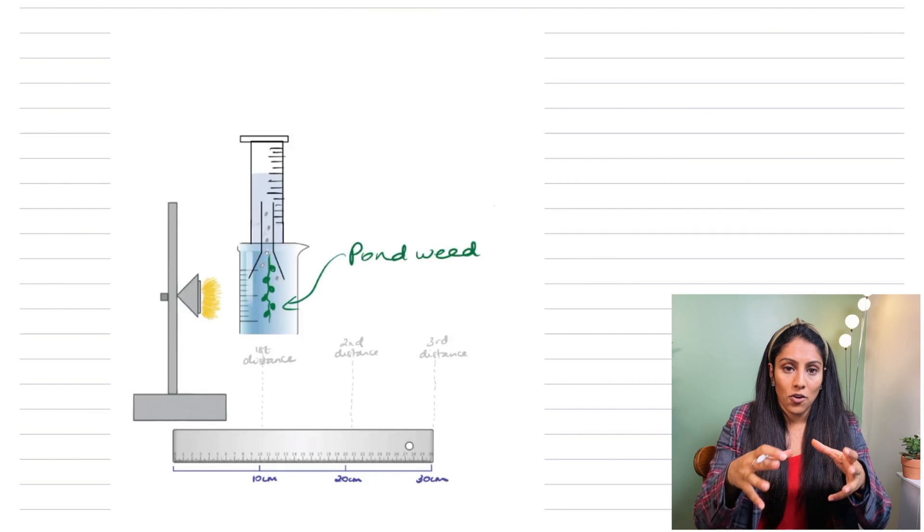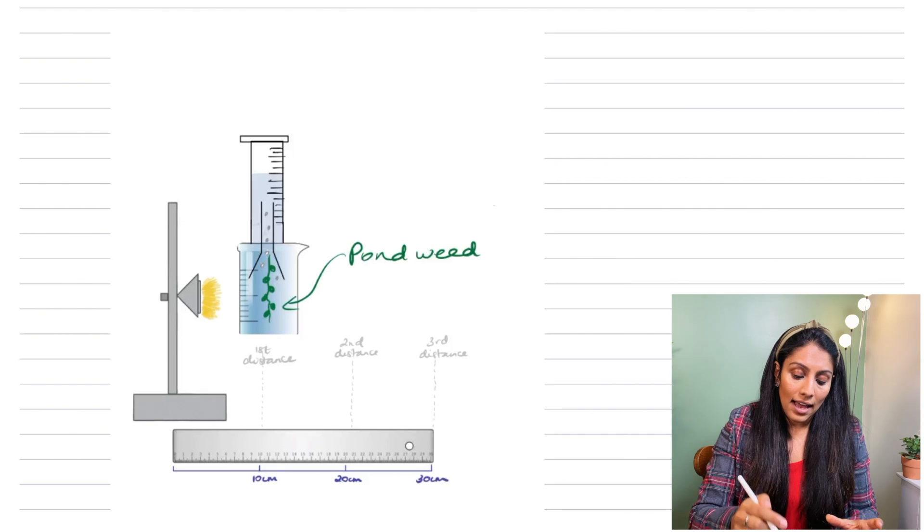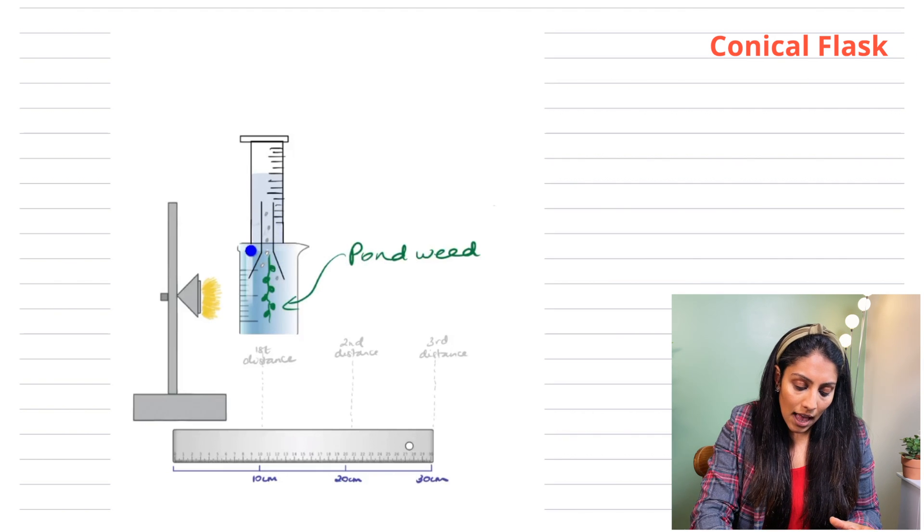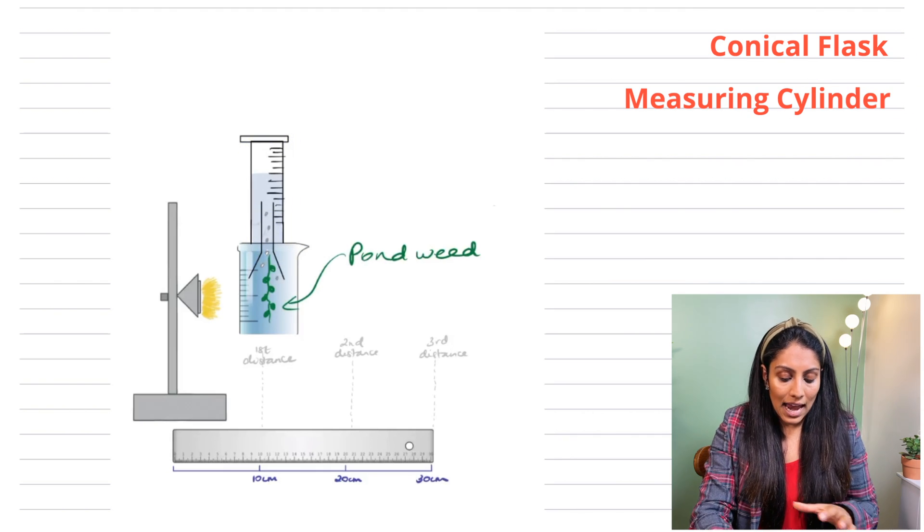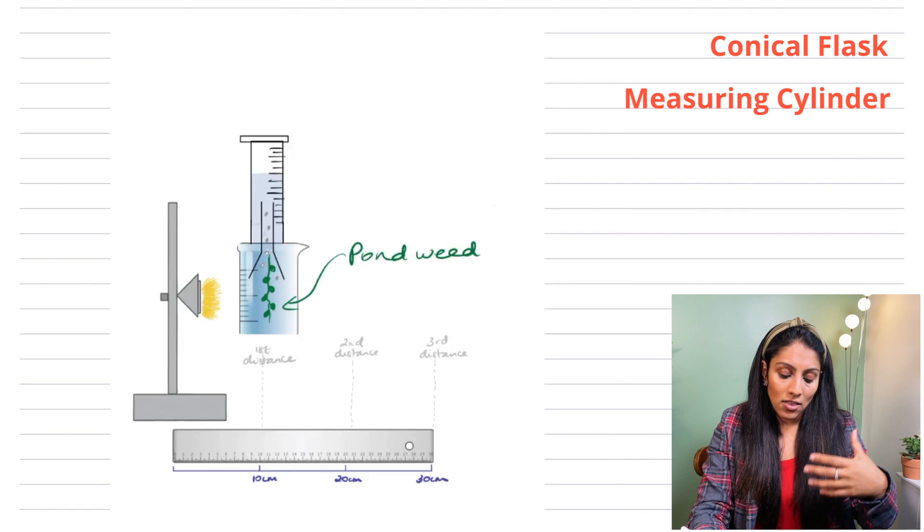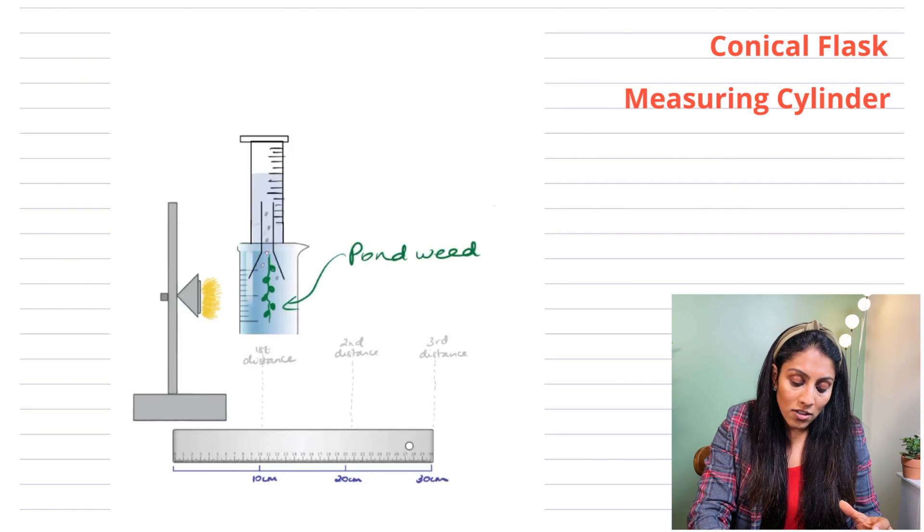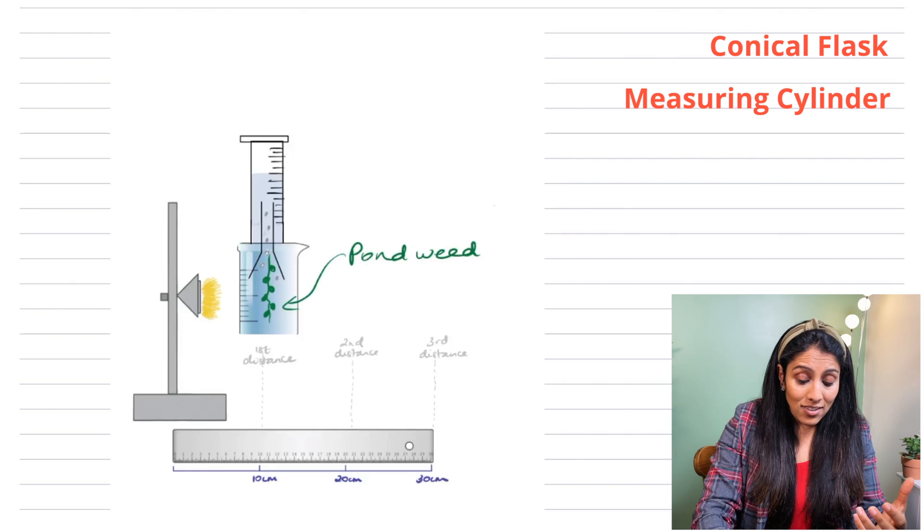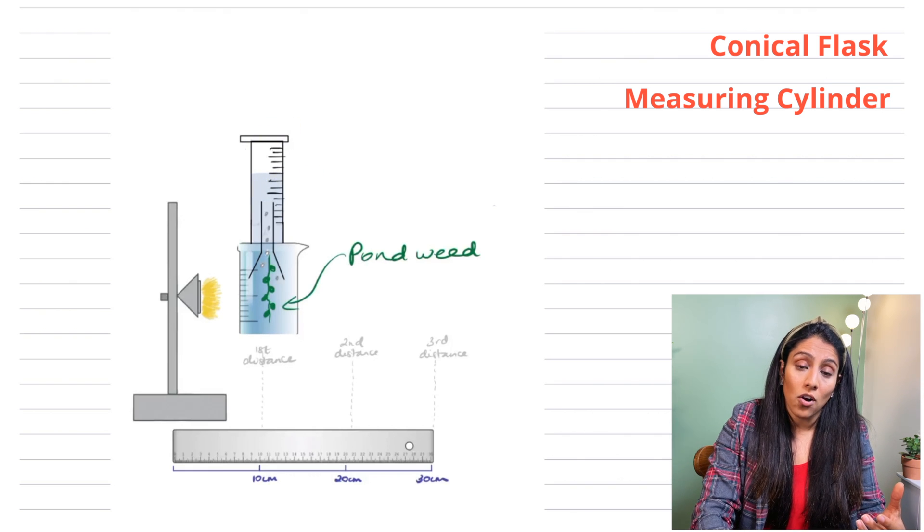So to resolve this problem we can change the method slightly. Now you can see here I've got a beaker with the solution and I've got a flask. That's my conical flask and I've got a measuring cylinder. Everything else I'm keeping the same and the reason I'm doing this is the flask will direct the oxygen bubbles into the measuring cylinder and I can now actually measure the volume of oxygen rather than counting the bubbles. So that's everything you need to know about this required practical for photosynthesis.